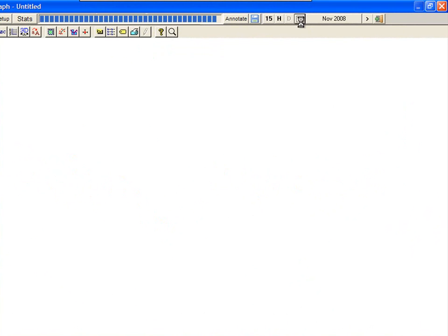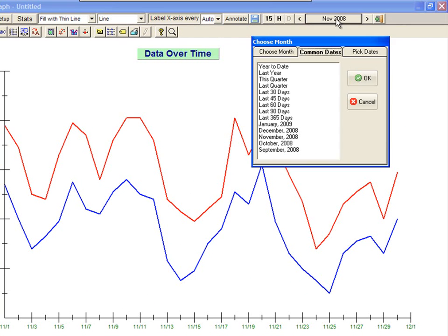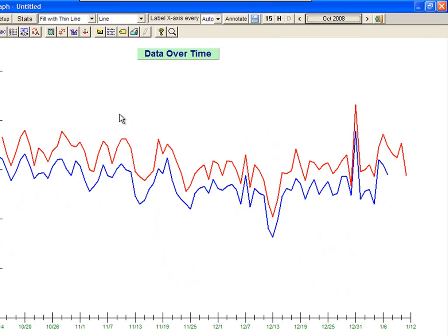And again, with the graph pack, I can look back over the history of time. Some of these points, again, the BOD data is coming from the lab. The red line, the UVAS reading, is coming from my SCADA system, but I can easily put these on the same graph, and I have some shortcuts that make it easier if I want to look at longer data periods. Notice that my UVAS reading has got 5 more data points on it. That's because, again, the BOD is a 5-day test, and this is up to the current date, so I can't know this data till then. So it looks like I got a pretty good correlation.